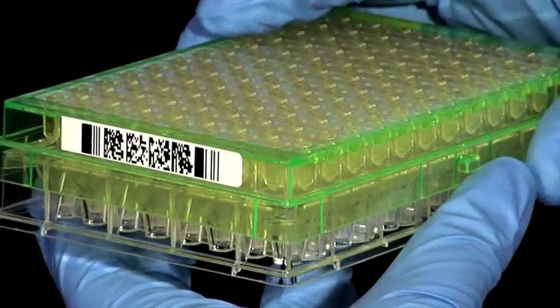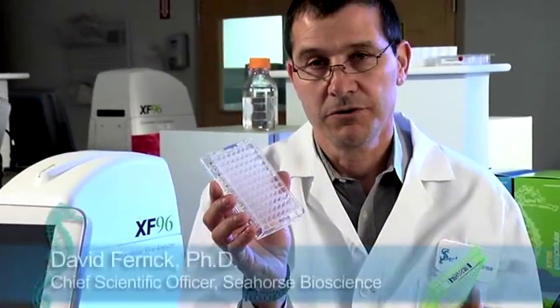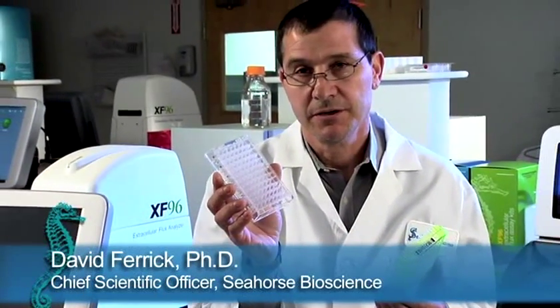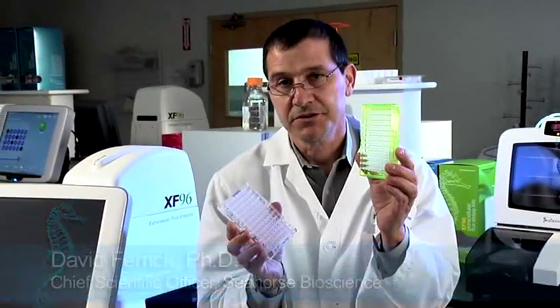The heart of the XF assay is the disposable assay kit, which contains either a 24 or 96 well cell culture plate and a solid-state biosensor cartridge.